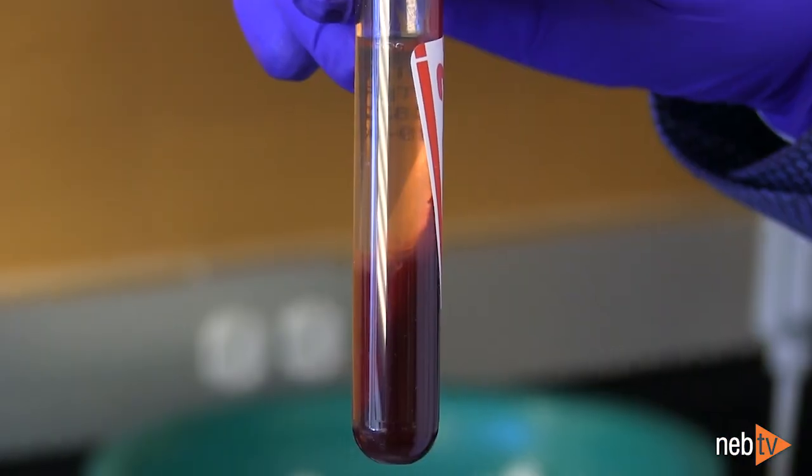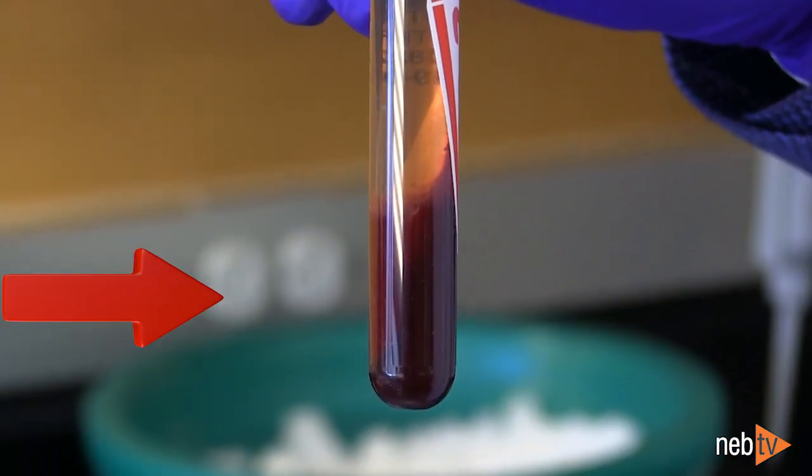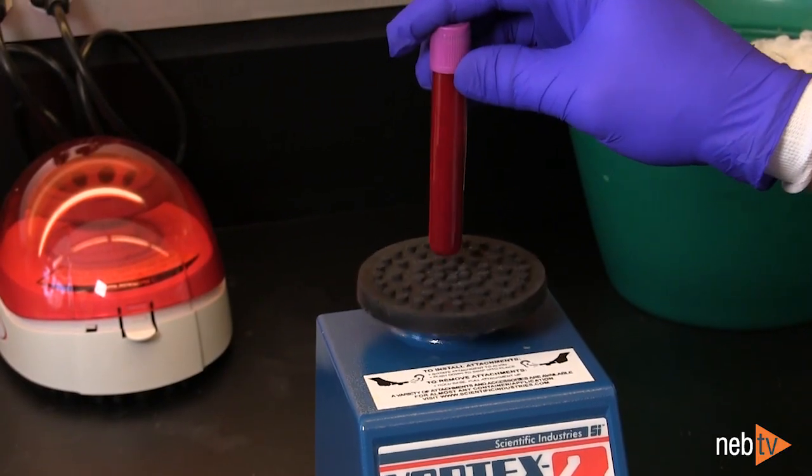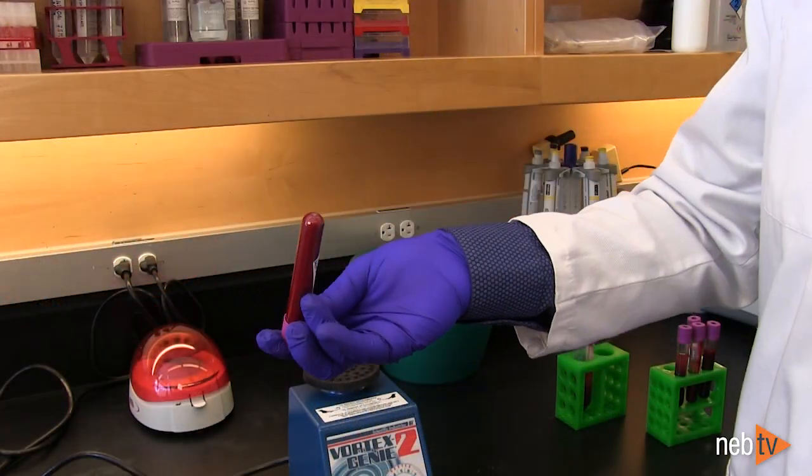It should be noted that storage of blood at 4 degrees Celsius will lead to sedimentation of cells, so it's important to resuspend the sample before processing, either by vortexing or inverting thoroughly.